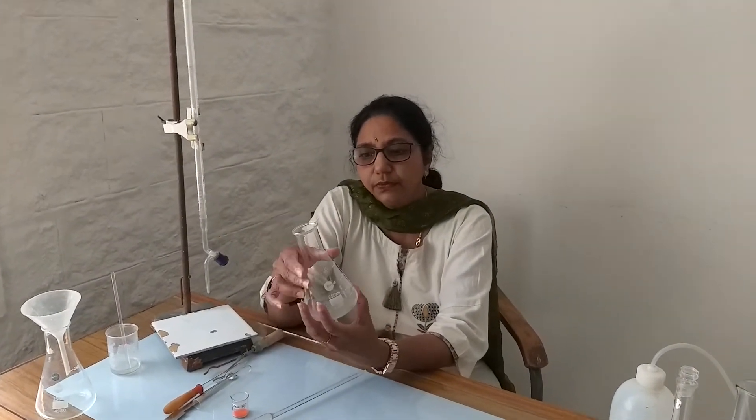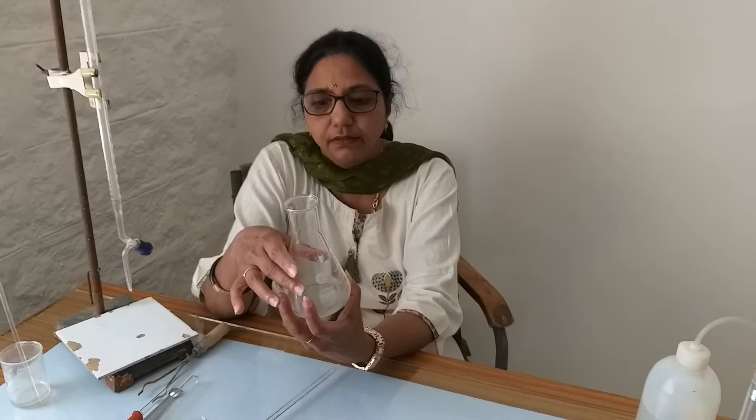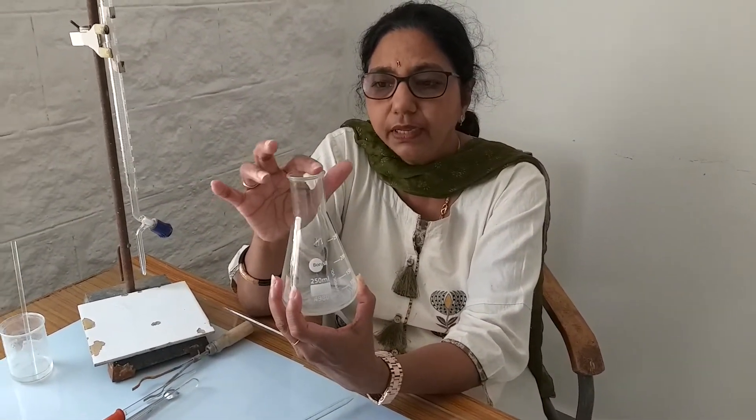We use a conical flask. The conical flask is conical in shape with a small narrow mouth.